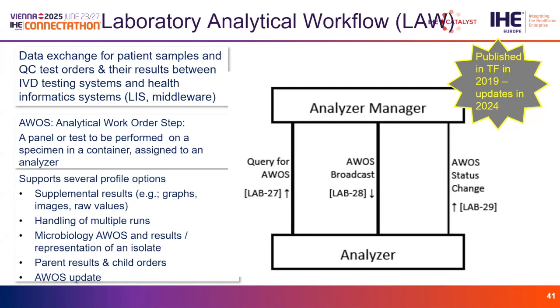Usually, the analyzers work in a bidirectional way, so they have two different modes to get the work orders from the analyzer manager. One is the broadcast, when the analyzer manager sends the analytical work order steps, broadcasting them to all the analyzers. And the second one is when the analyzer queries for the analytical work order steps related, for example, to the specimen it received.